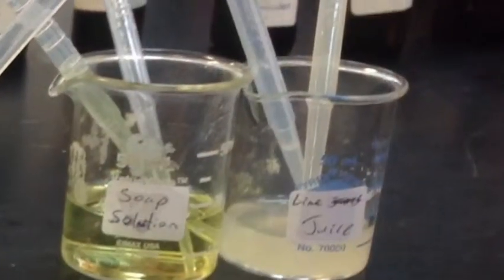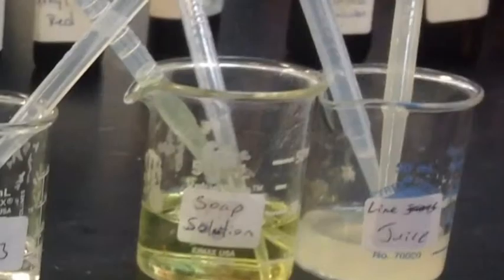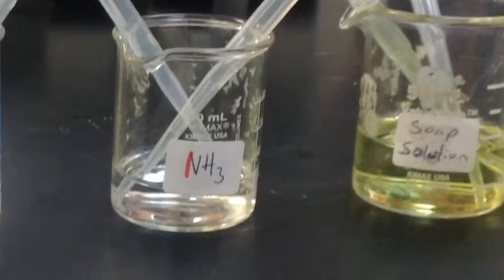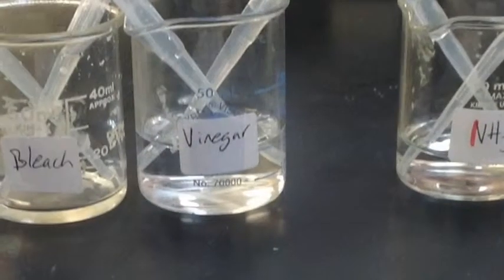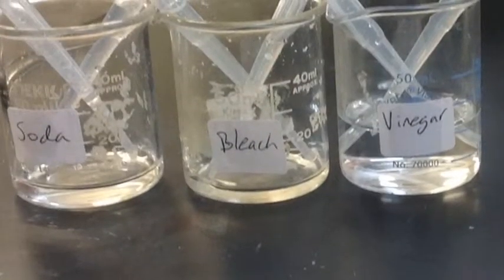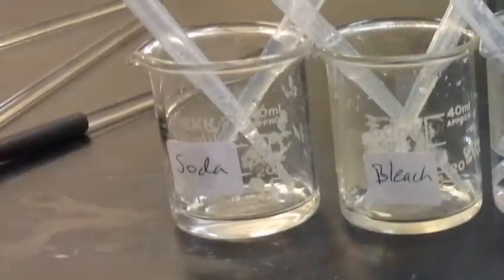The color change of an indicator is related to the pH because each indicator at a certain pH will give an acid or a base a certain color. For example, if thymol blue is at a pH range of 1.2 to 2.8, it'll give the acids a reddish color and the bases a yellowish color.